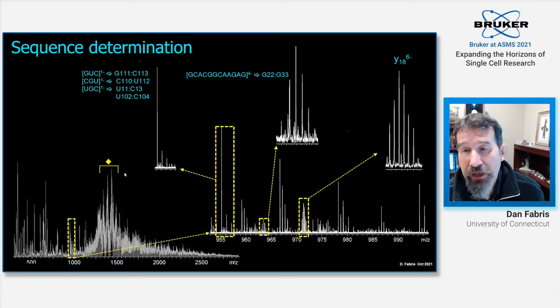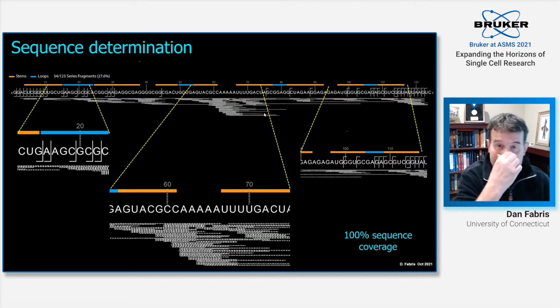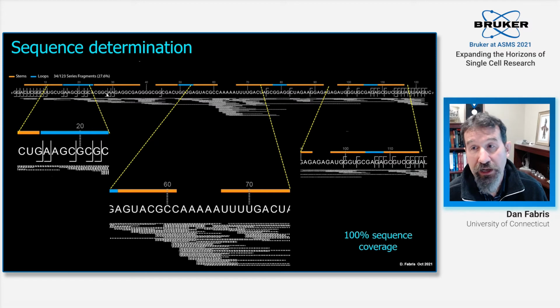And this already shows how important it is to obtain larger fragments that are less fraught with ambiguities when doing the data interpretation. When we first obtained this data, the interpretation was done by using Mongo Oligo Calculator, some freeware available on the web, and a spreadsheet. And we started to plot the possible fragments here against the sequence of the precursor ion.